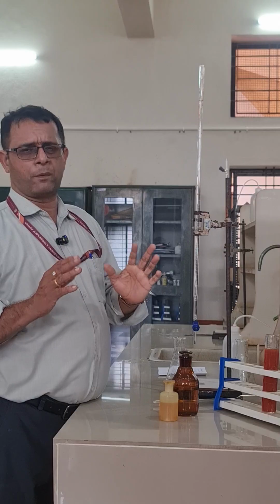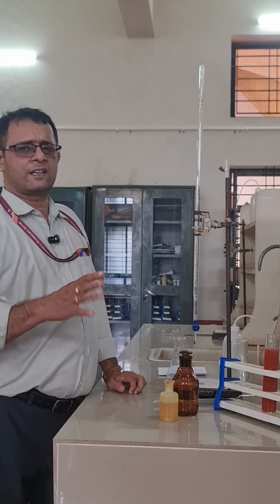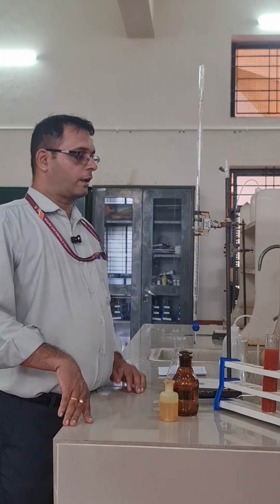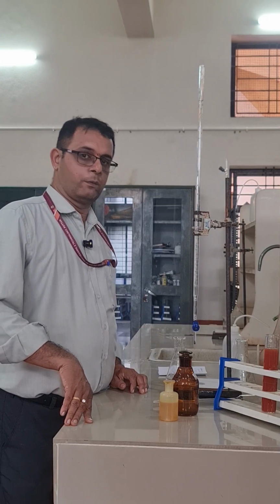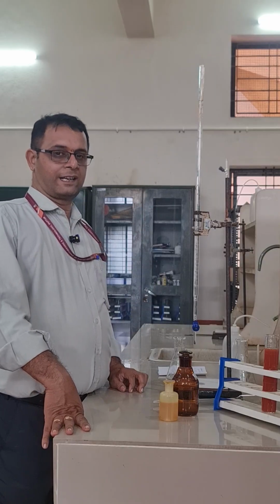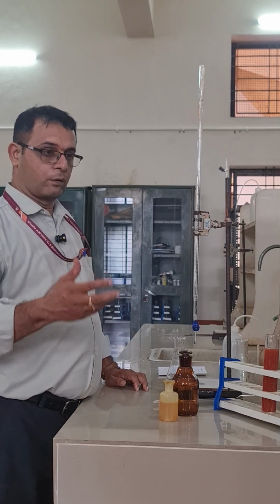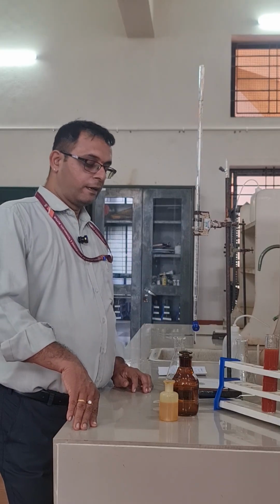Chloride is a very important parameter in water, because salt content sometimes gets added into the water, which will start contaminating it. So for drinking water, we should know the maximum permissible chloride value. If you go very near to the seashore, the chloride value goes on increasing, right? Similarly, if wastewater contamination is there in the water source, then the chloride will be very high. Even in wastewater, the chloride value will be higher.